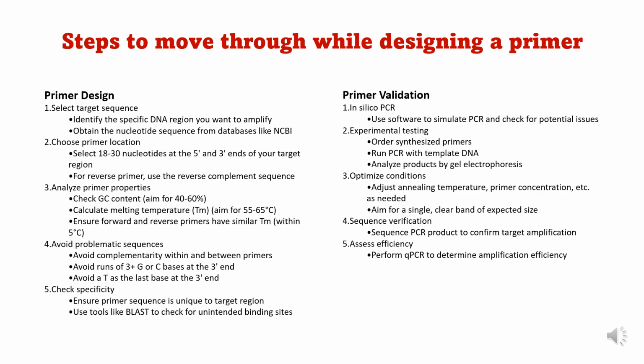We'll check its specificity by ensuring the primer sequence is unique to the target region. We'll use tools like BLAST to check for unintended binding sites. Finally, we will do some primer validation using some in silico software, and we will design our own experiment.